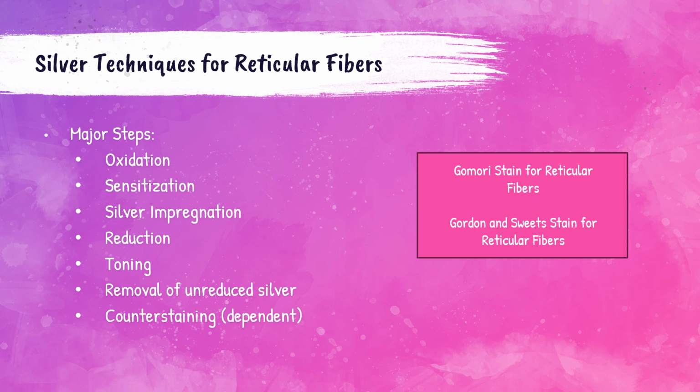The last step is counterstaining. So whether or not this step is performed is dependent on what type of tissue is being stained.